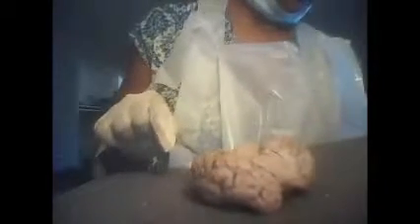Right now I'm going to demonstrate for you the cerebellum, pons, and the medulla oblongata. As you can see, I've already dissected the medulla oblongata. If I can get that for my camera, I'm pointing right there. It's the long stem area in the posterior of the brain.